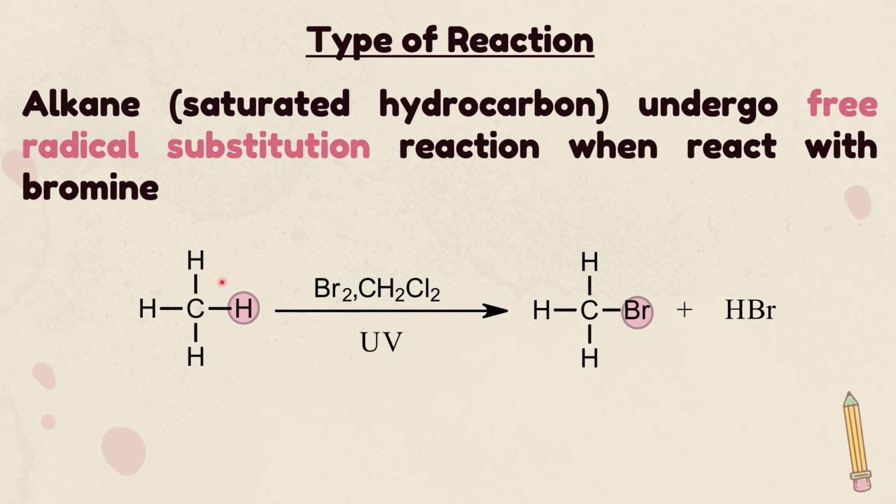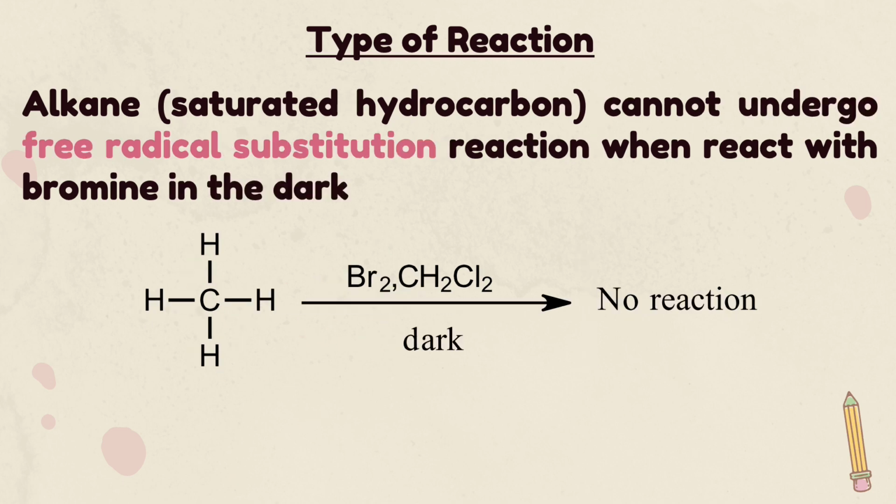So kalau kita buat reaction alkane ni dengan bromine, condition tu we kept the reaction in the dark. Tak kisahlah awak tak ada almari ke apa, no reaction will happen. Macam mana saya tahu no reaction will happen? Saya akan observe the color of the bromine ni.